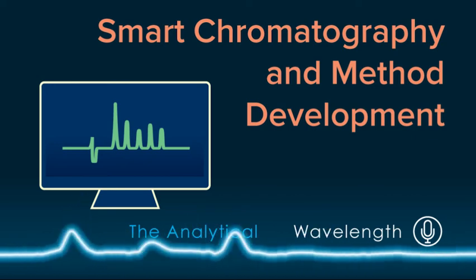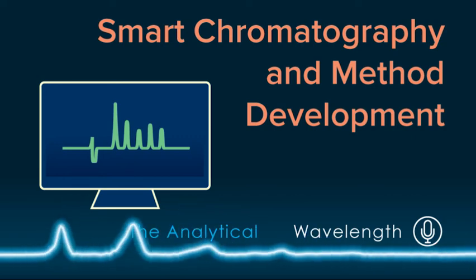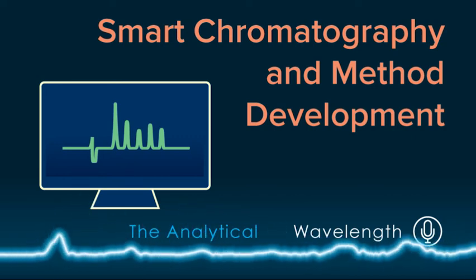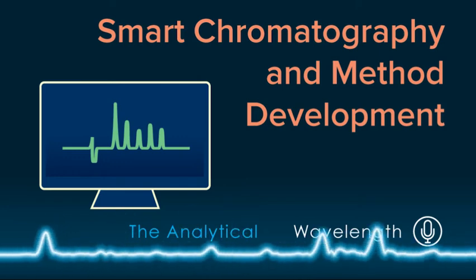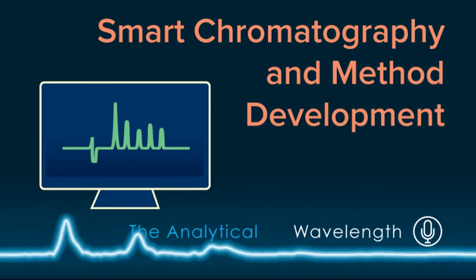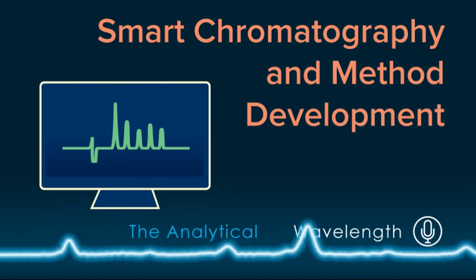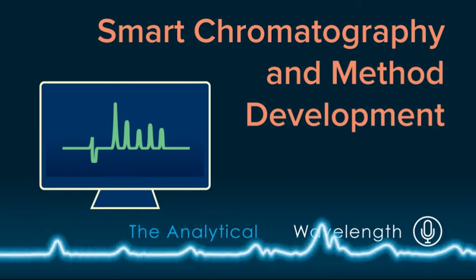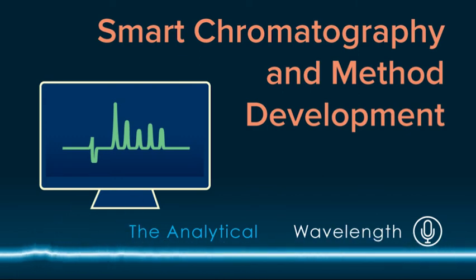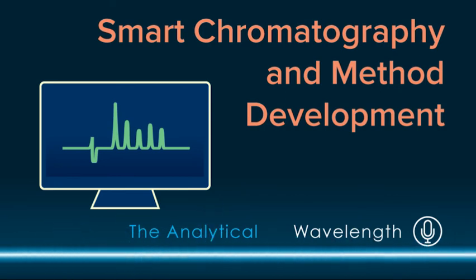So a couple other things I'd like to say that are additional thoughts for scientists who are getting into this. The thing I would like to say is stay tuned. This is an ever-evolving field at the moment. We have seen massive growth in the use of chromatography method development, particularly in the small molecule space. Most of us in pharmaceuticals and other industries are using it for reverse phase, normal phase, chiral separations, and even a couple others. We're seeing opportunities to create databases and do a pseudo QSRR approach where we might have a new compound come in and we may put that in against our library and say, ooh, this column in these conditions worked for this compound, which looks very similar. A lot of growth in that space.